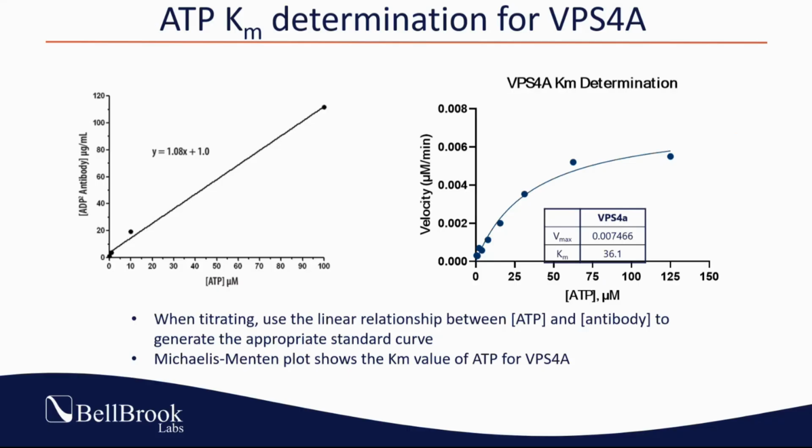Okay, so that comes to the second part of the talk. Here I'm showing an ATP-KM determination for VPS4A. This is an important early step in determining the enzyme parameters for VPS4A as we progress towards doing drug screening and follow-up dose response assays.